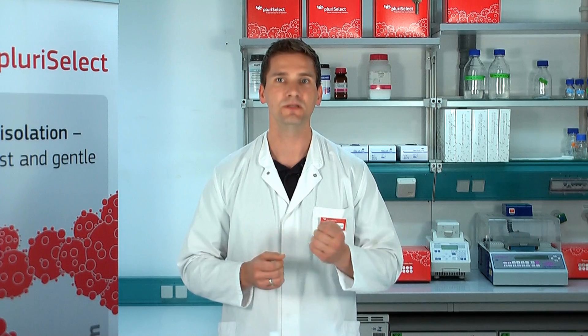Hello. The standard cell isolation method takes up to two hours, but during this time your RNA and protein profile will already change. So it's absolutely important to stabilize your RNA and proteins quickly to minimize artifacts in gene expression and protein analysis.